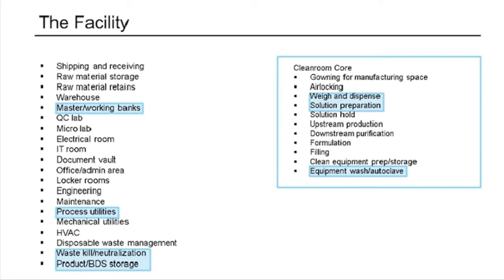And then for those operations, are the cells going to be arriving fresh? Do you need to have spaces that can accommodate the logistics of accepting fresh cells and maybe storing prior to their being able to be processed? If we're doing an allogeneic batch, now you likely will have cell banking or donor cell storage. And so those might be vast. It would depend on your process and how you store those cells prior to use.